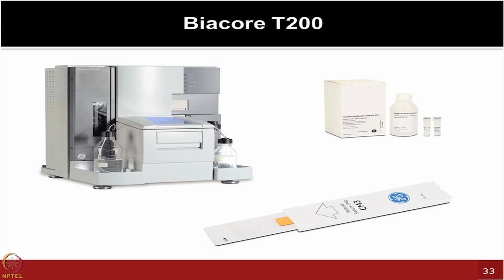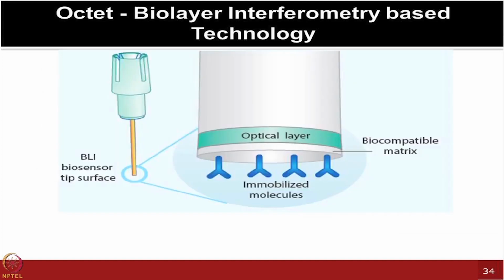So many times if you are in the discovery development mode and you have hundreds of compounds or libraries to screen, this may not be the best platform to start with, because you are limited by how much cost you have to screen that large number of compounds. So new technology platforms like the one I'm showing you here, which is a biolayer interferometry based platform, can be very powerful for the first round of screening.